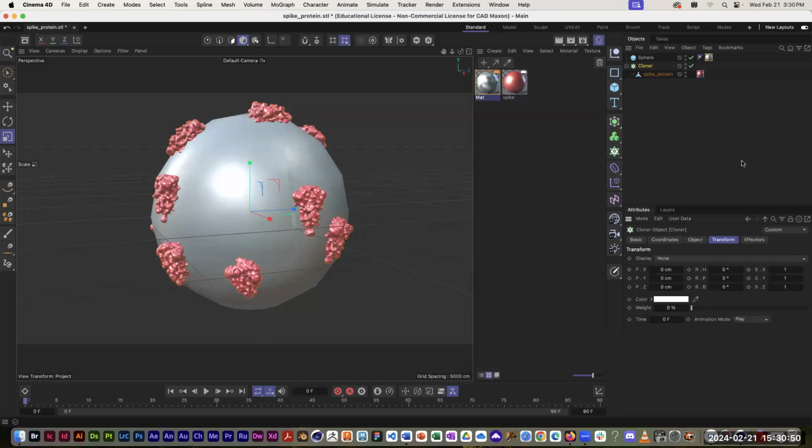So I think what I probably need to do to get these spikes to rotate into their correct position, I know this just from trial and error, but you can enter different angles in these three different spaces. Just from having done this before, I'm pretty sure it's the RP. And if I put 180 degrees in there, no, it just flips them.